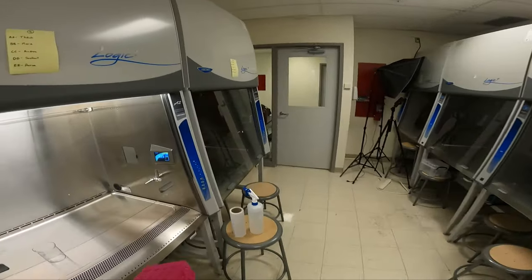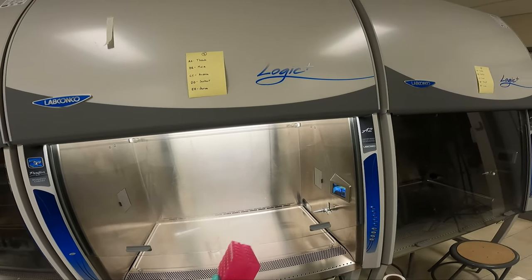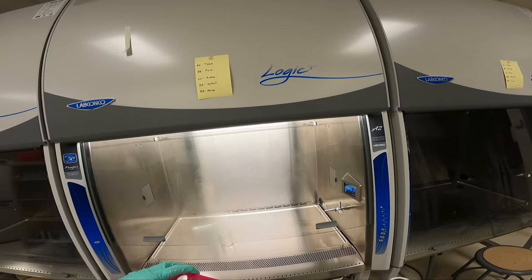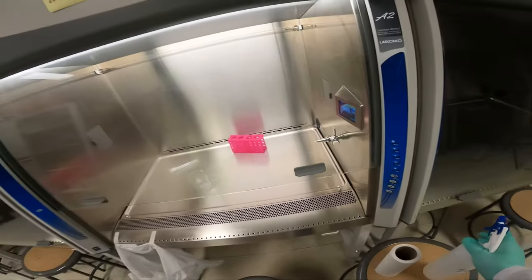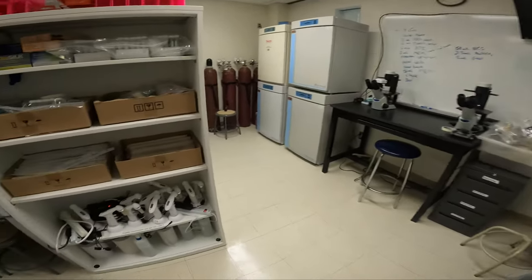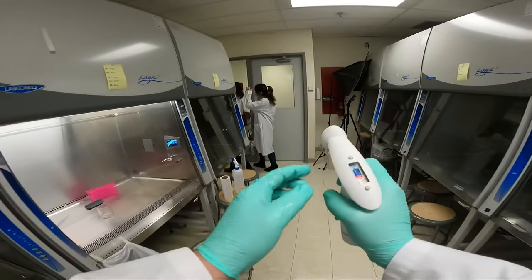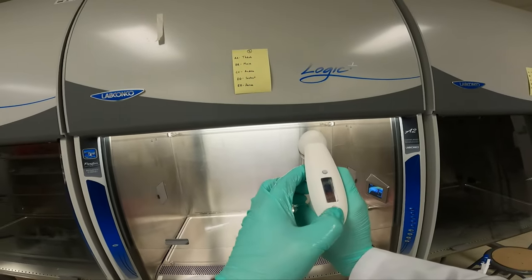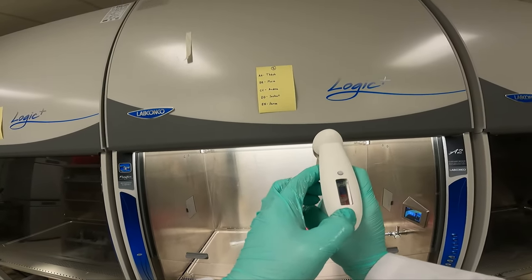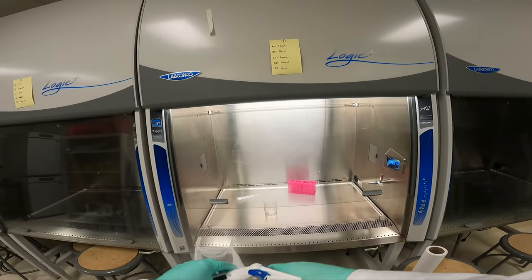We'll grab a pipette rack. Make sure you spray the pipette racks separately — do not have items inside. We're going to spray the outside and the inside and place it into the hood. We'll get our pipette controller from the charging docks. Give it a shake to make sure it's not contaminated and make sure the settings are correct. It should be set to blowout, and it must be sprayed down with ethanol as well.